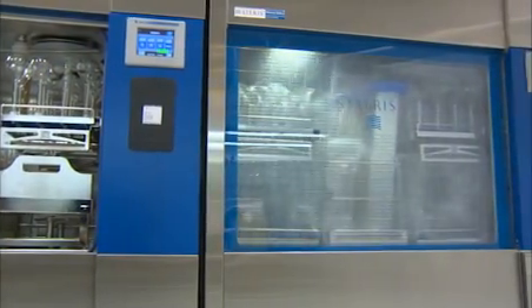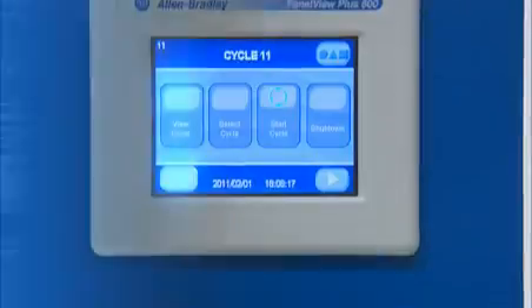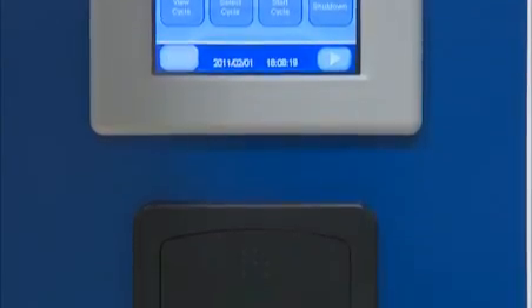Pump pressure is constantly monitored for optimal mechanical action. An impact printer can be provided to maintain records of the cycle process data.